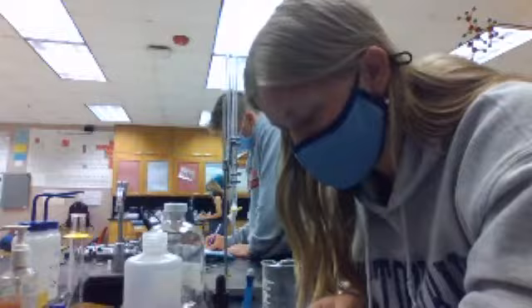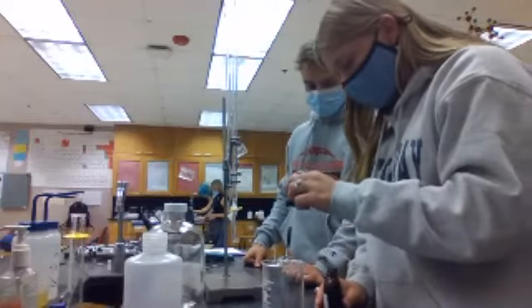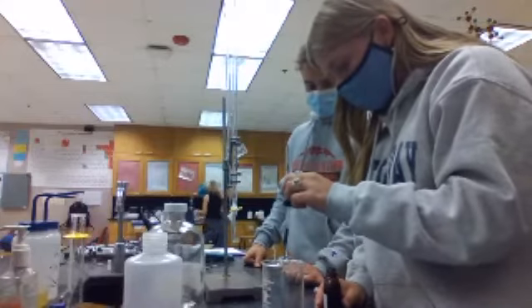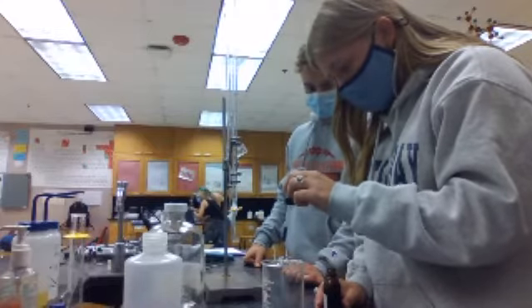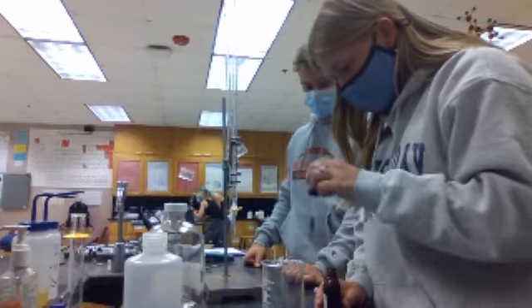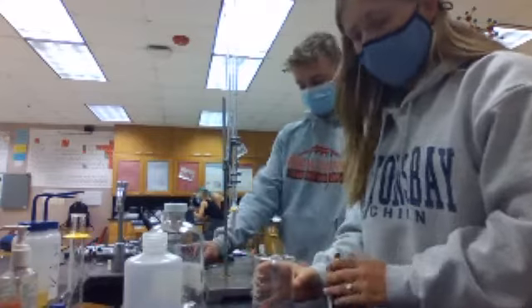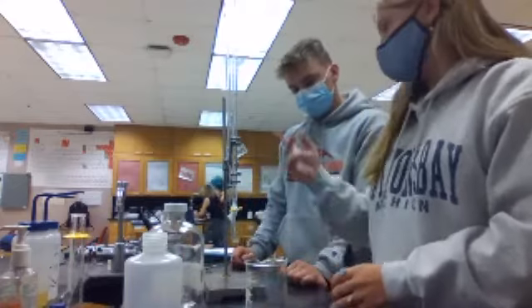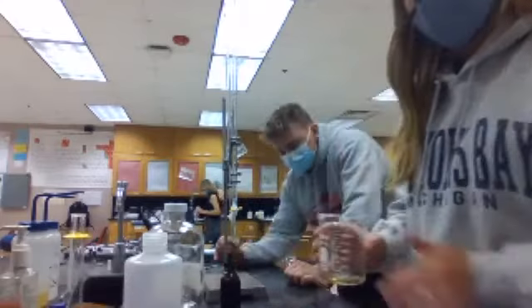Does that make sense, Margot? Yeah, because we're adding stuff. Well, we tested it again. Maybe yesterday there was error in the pH meter. The cool thing is that we'll be able to figure it out because we know the molarity of the base. So we're assuming it's going to be, how many milliliters did you guys calculate it to be? 8.47. How many milliliters have we been before? 9.8 and 9.9, right?